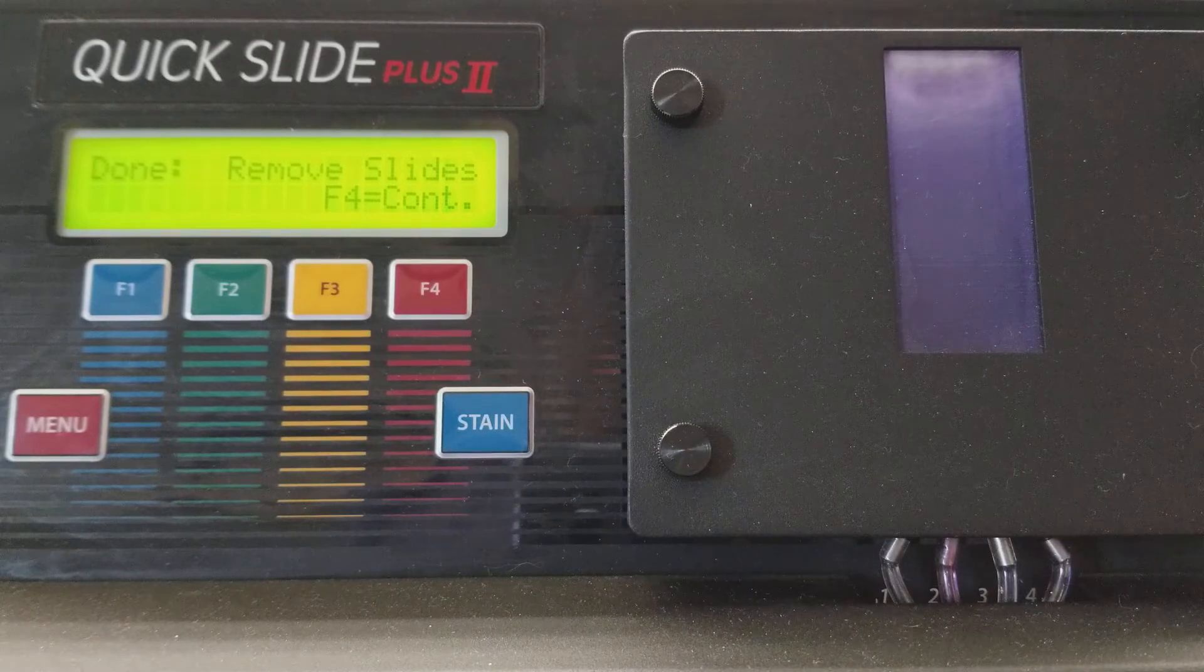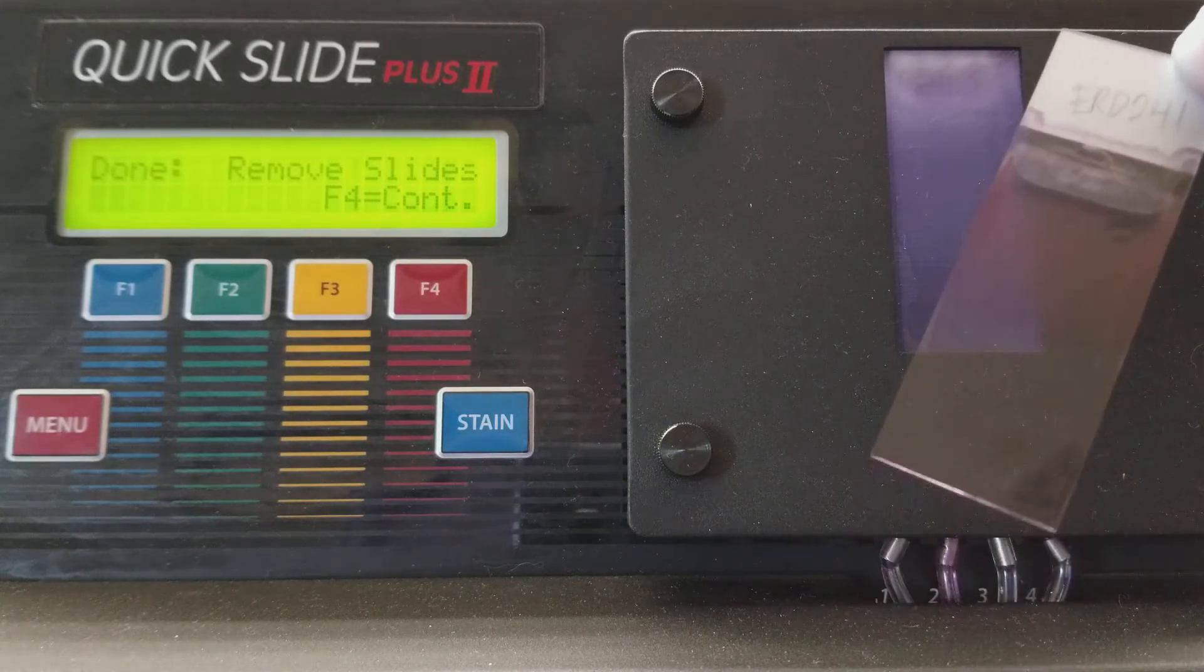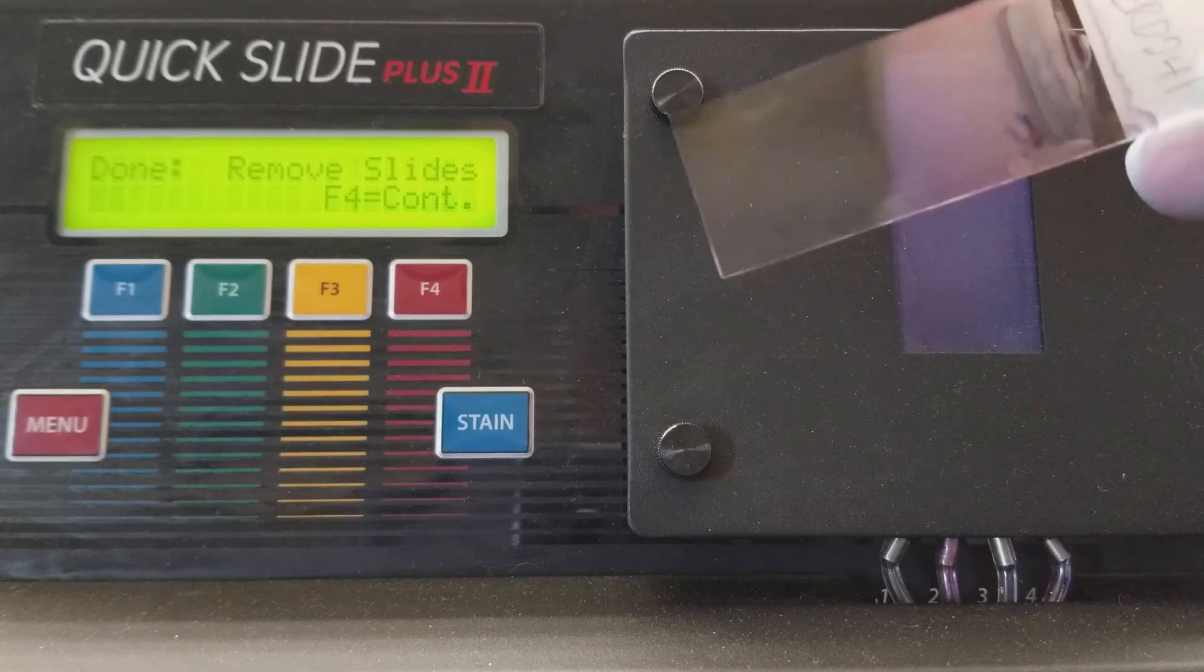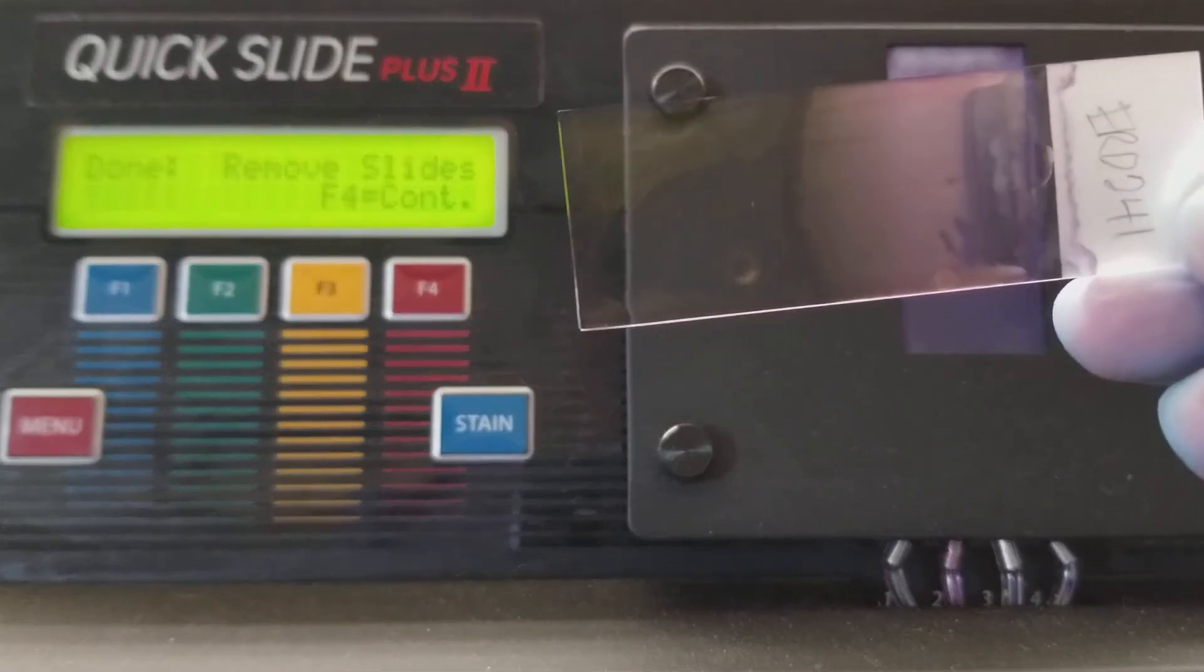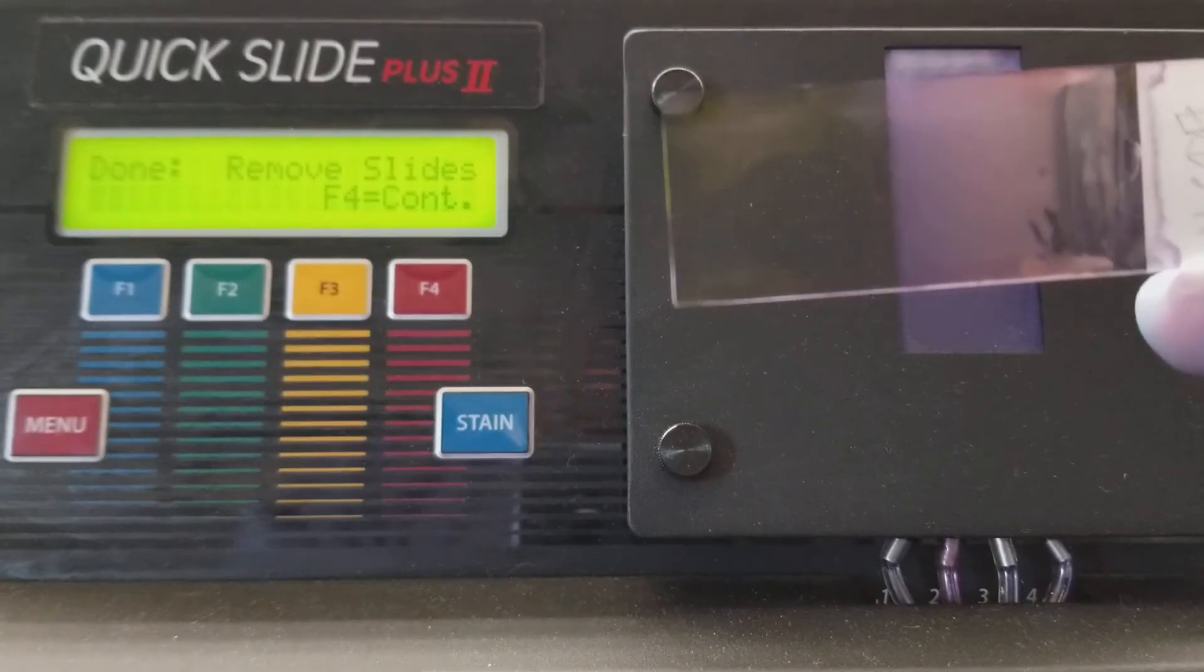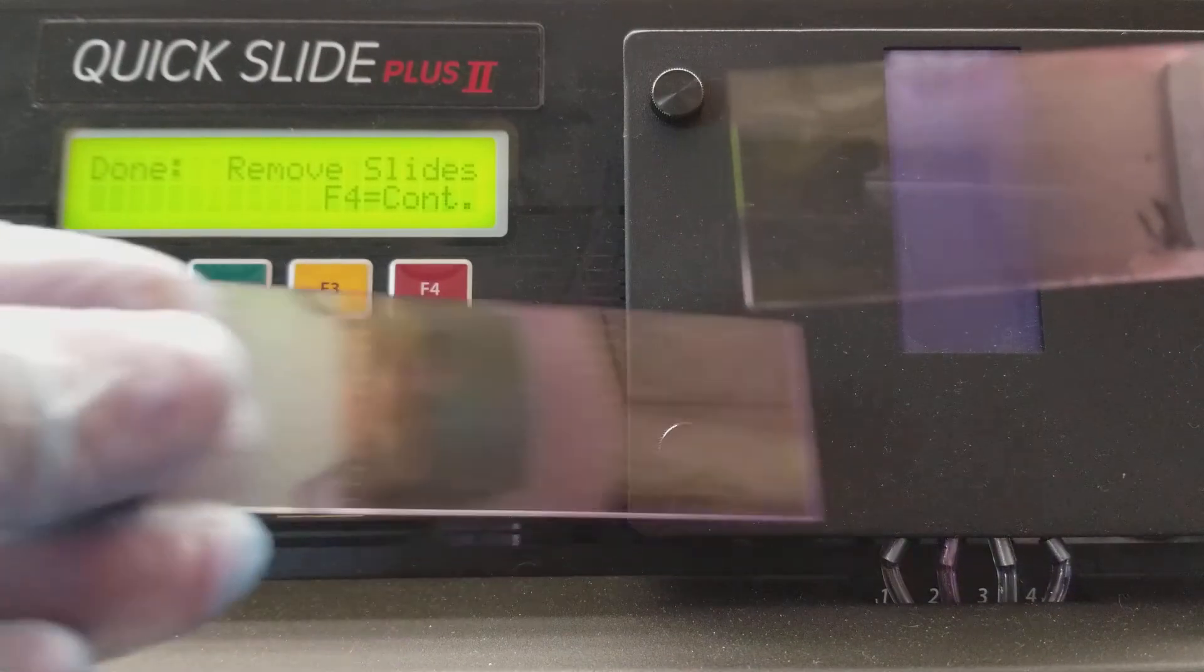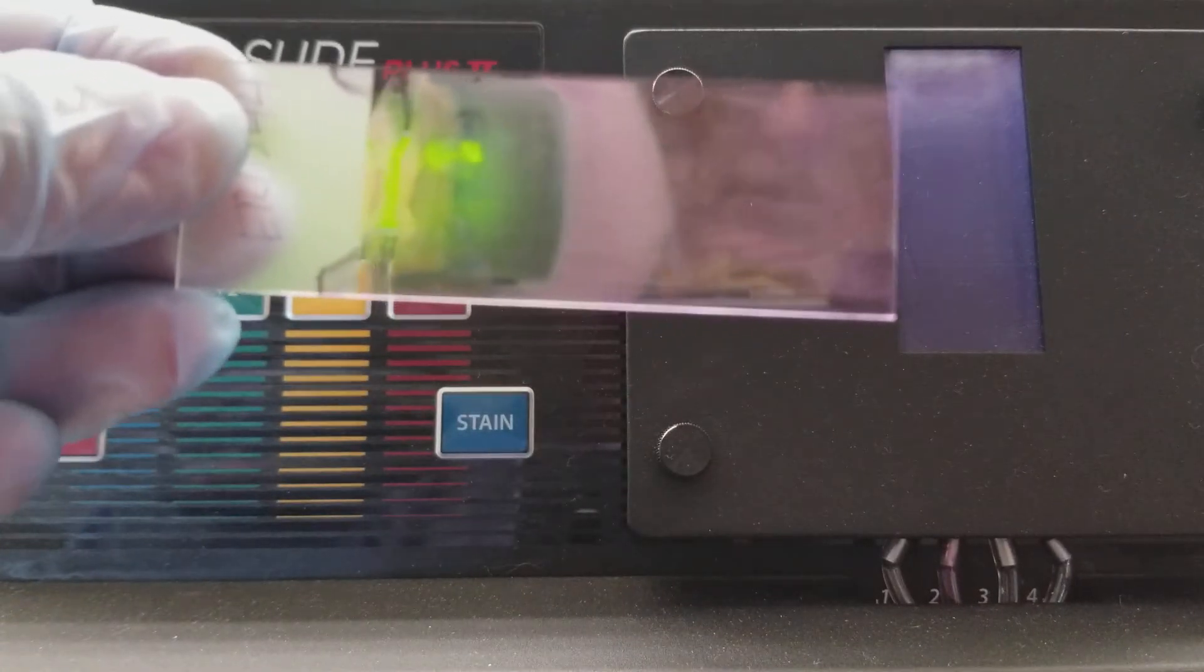And so here's the slide that looks much better than the first one I had done on here. If it's been sitting for a while and you have not primed it before you start, you'll get a slide that looks like this. And that's not good.